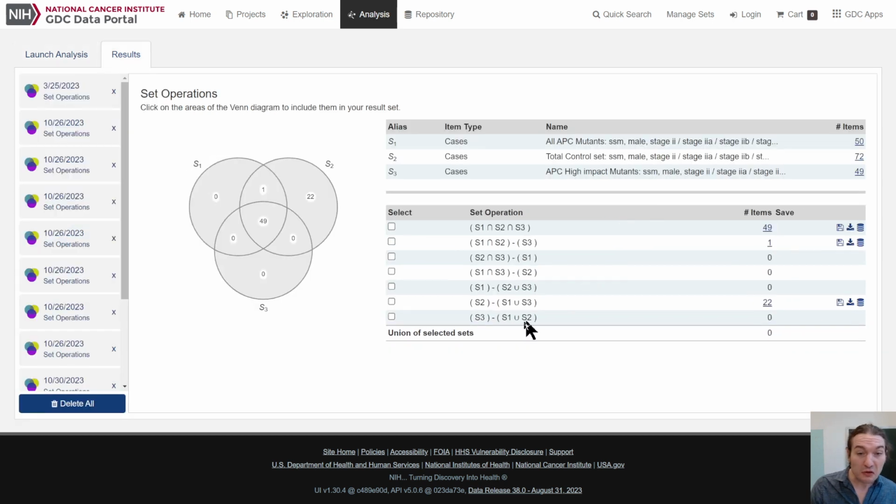I think maybe it confused people this semester, but there's one sample in that 50 that was all probably moderate impact mutations. But just for clarity, I like to separate anything that doesn't at least have one high impact. It's not necessarily always true, so I know that these are people who have these diseases.